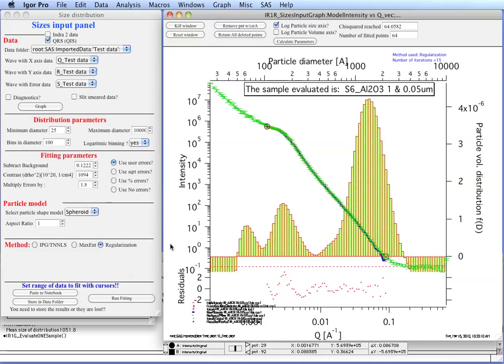So in conclusion here, this tool allows you to model one or multiple size distributions of scatterers in your material under an assumption that all of them can be well represented by one shape and one contrast. It will produce a distribution of the size range which you decide to use. And it is very user-friendly, very easy to use. So it is more often one of the first tools people try to apply. The danger of using this tool is that often the materials really do not have the structure which supports this tool. In other words, you often cannot assume that all of the particles can be represented by a simple shape, one of the available shapes only, and the chemistries are all the same. So in that case, you will have to use more complicated tools, generally the Modeling 1 or Modeling 2 tools, which should be available in another movie.